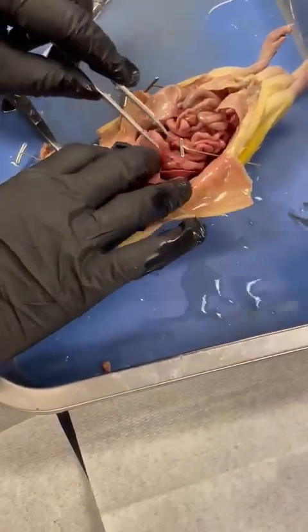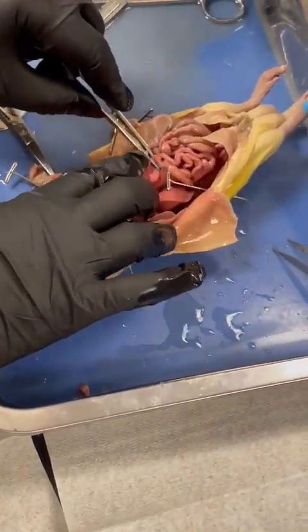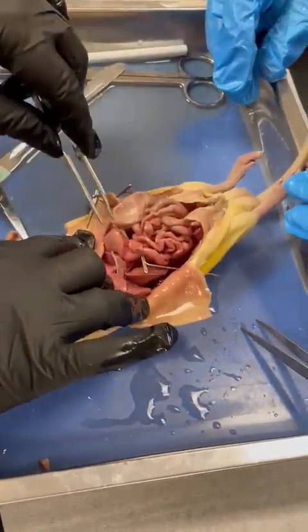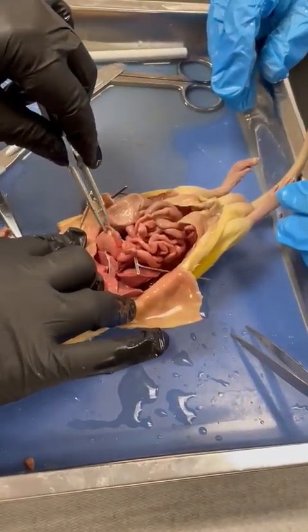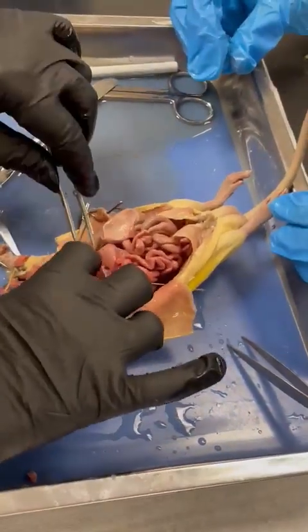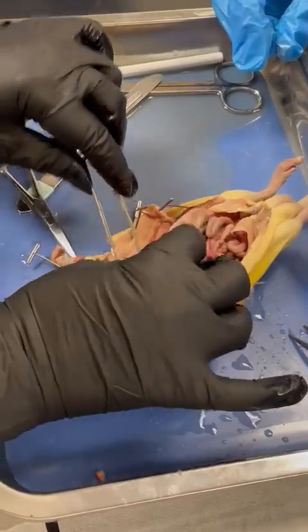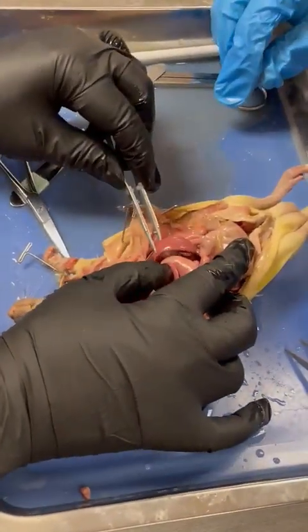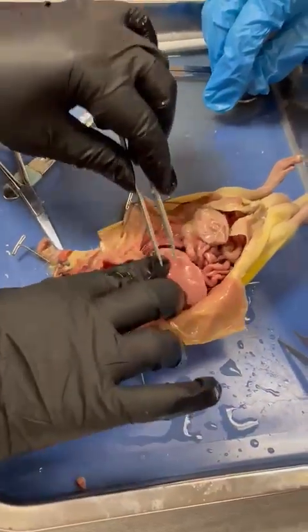So liver, stomach. The stomach leads to the duodenum, a small U-shape, which is where you have the pancreas. This is the pancreas. The pancreas opens there into the duodenum. To the left of the stomach is the spleen. This is the spleen. And that is the liver.